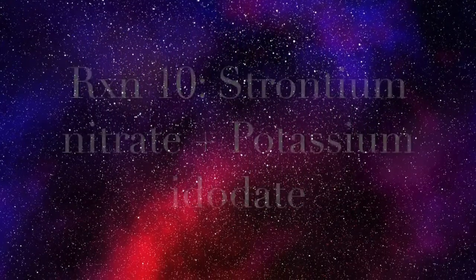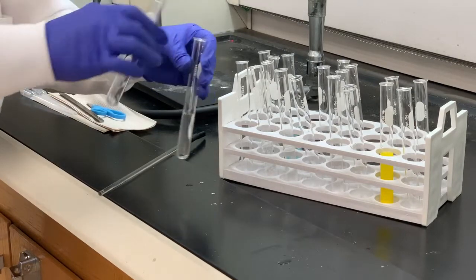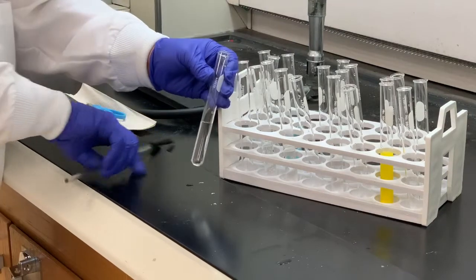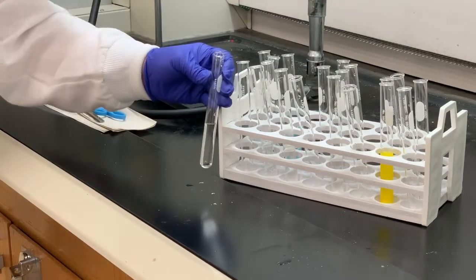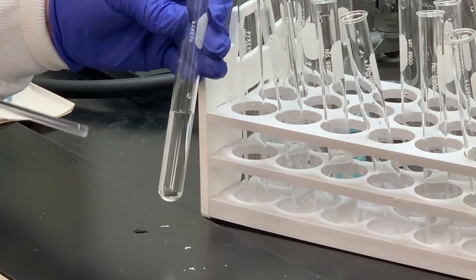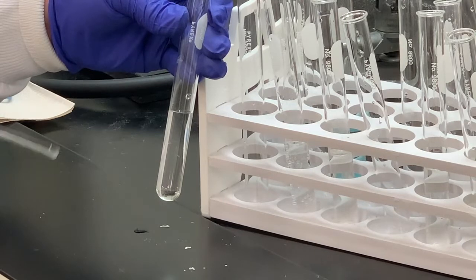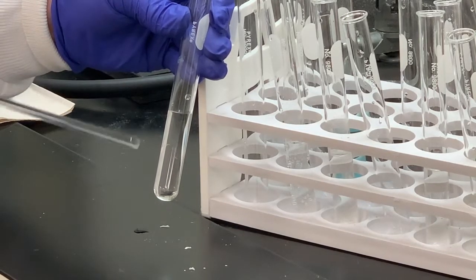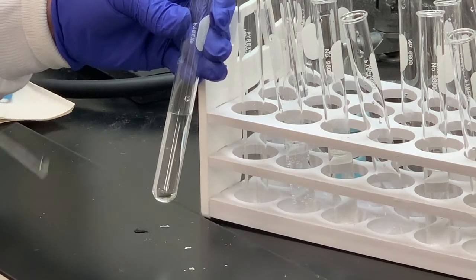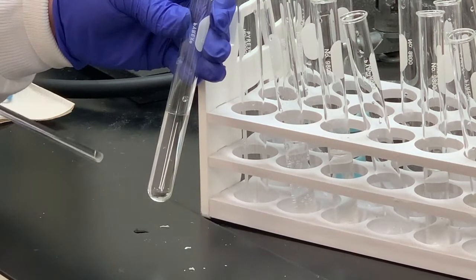Last two chemicals to combine, two clear aqueous solutions, colorless solutions, are the strontium nitrate and the potassium iodate. And I'm going to mix these together. Now notice there doesn't appear to be any reaction. Your lab instructions will tell you to wait maybe 5 or so minutes to see if a reaction occurs. What I want to do is to use a stirring rod to stir this and to see if I can facilitate that process so it won't take 5 minutes.